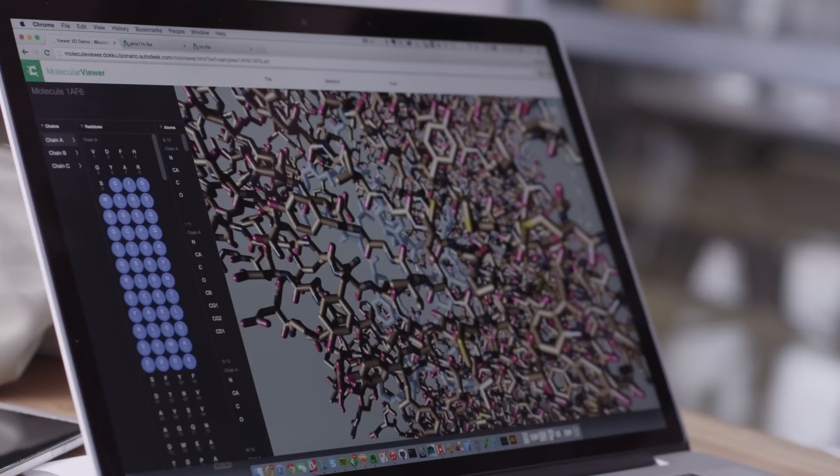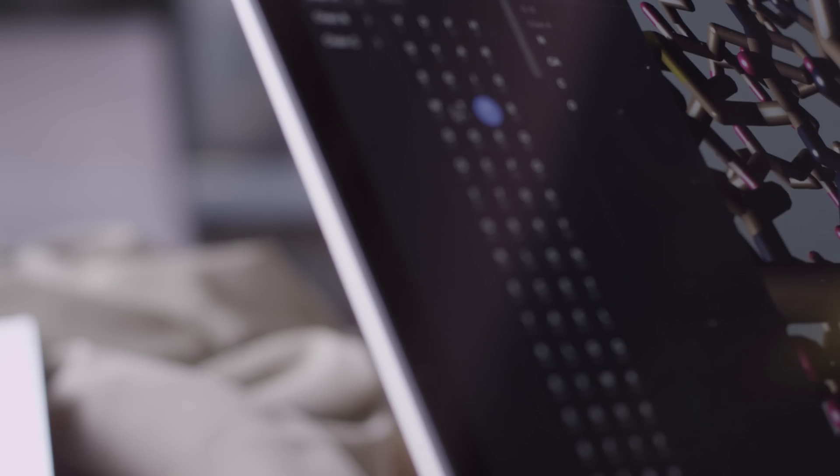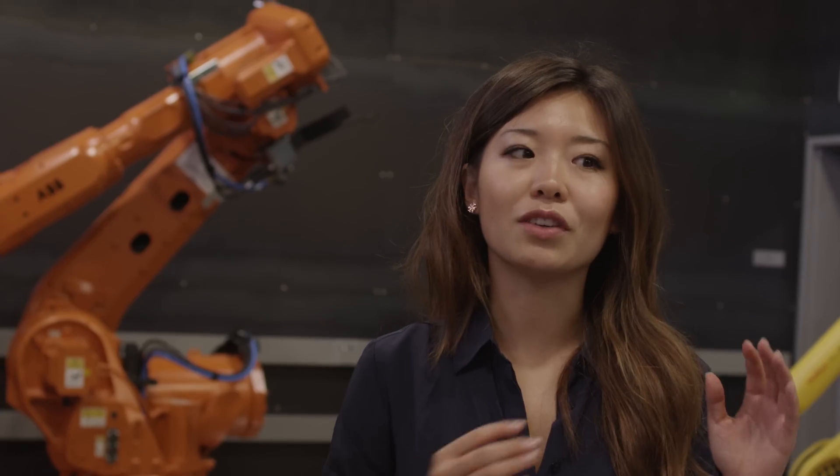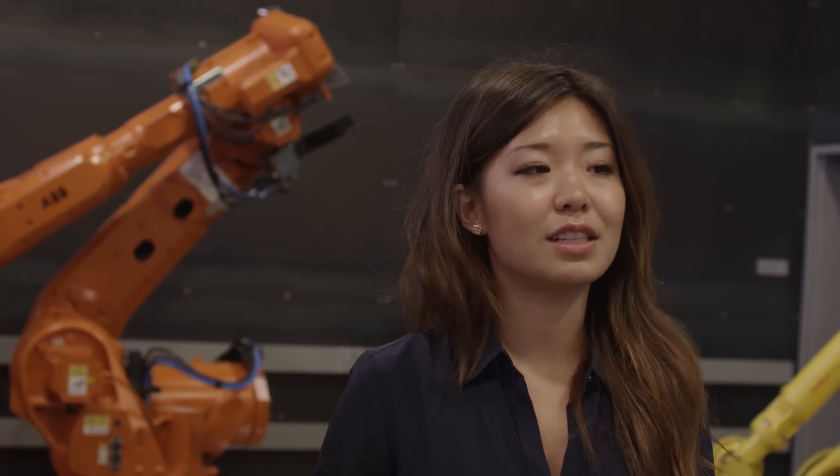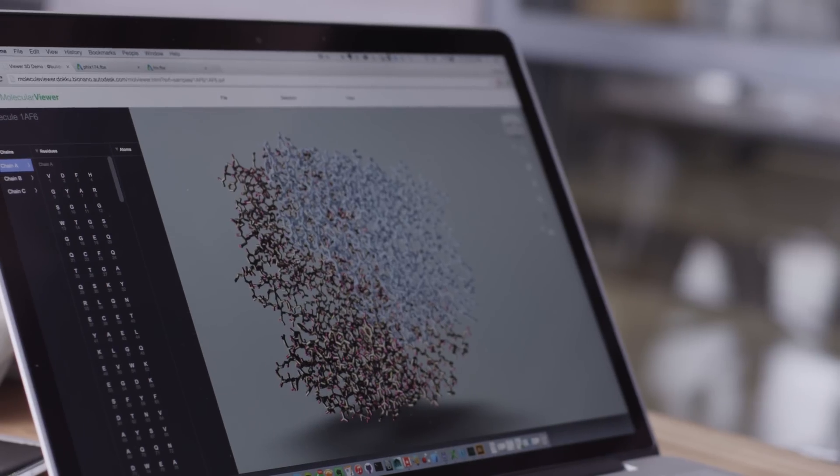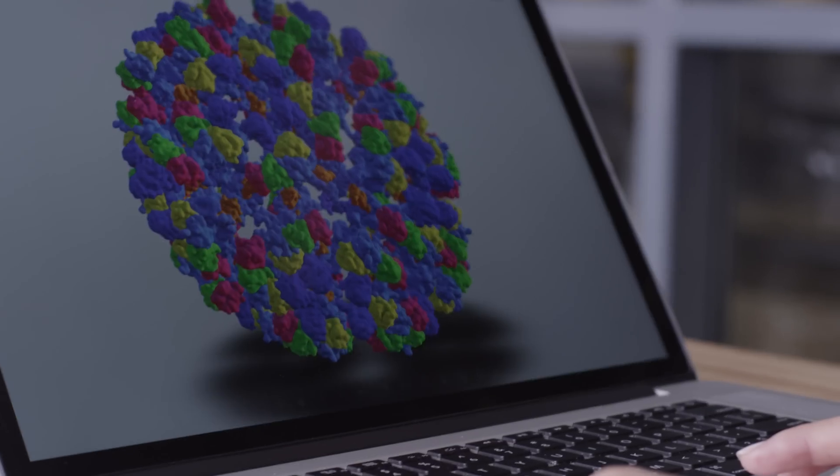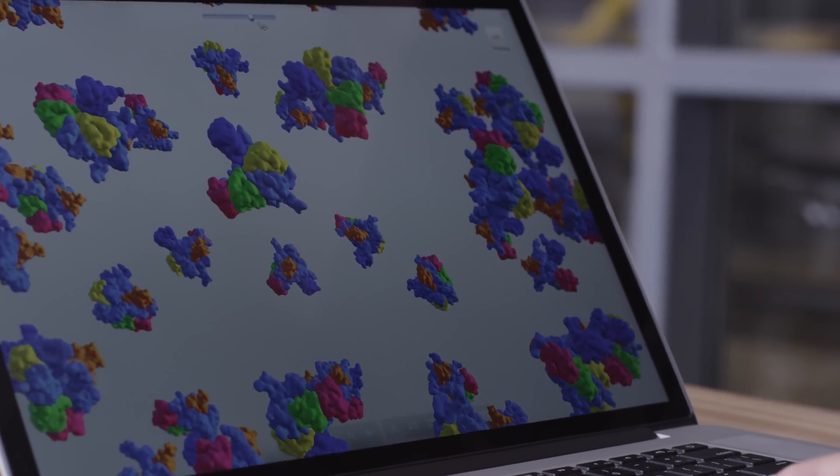We take the raw data and display it in a very digestible format, which is also linked with the 3D model itself. There's an interconnect between the data and the model where you can traverse different scales of the protein, much like you can traverse different components of a building or a car. We'll be able to represent the model in different ways, in different representations and data-driven color schemes to aid the scientists in their target research.